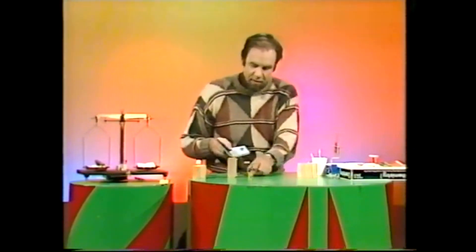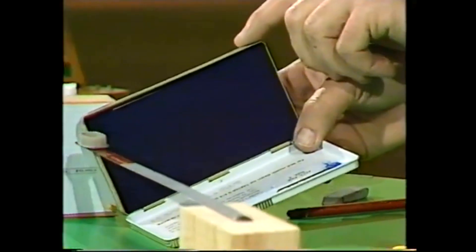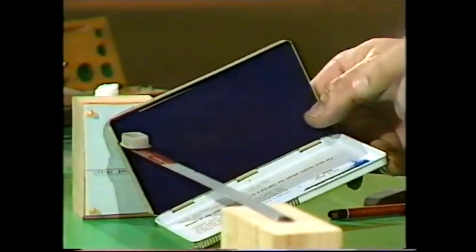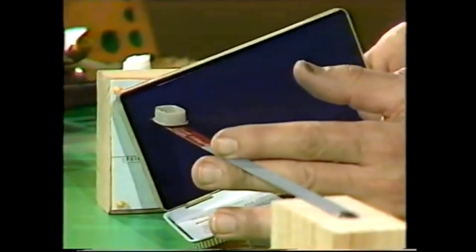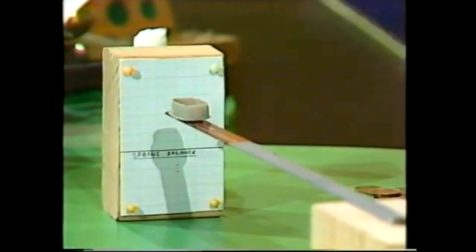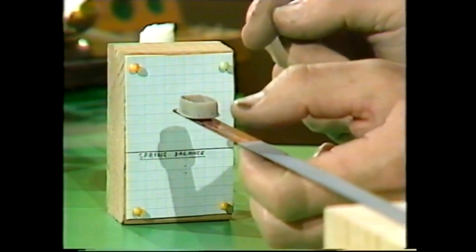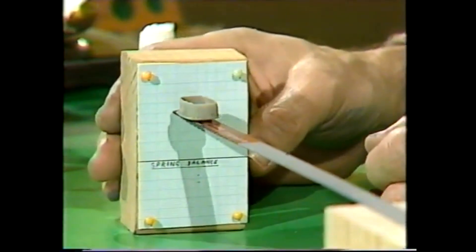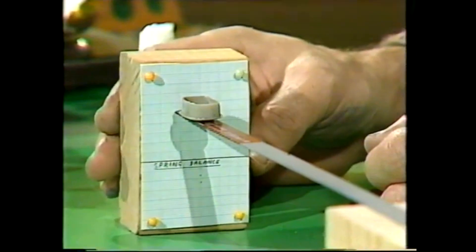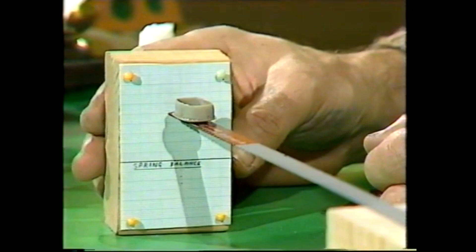For that I like to use an ink pad. You can use a pen, or just ordinary ink, or even a pencil, but the ink pad is good because the ink doesn't dry very fast. Just rub that on the end of the pointer, and stop the pointer from jiggling by touching it with a finger. When it's still, bring it up to the paper, and that will give you the point at which the scale has nothing in it. There we are — a little mark there.